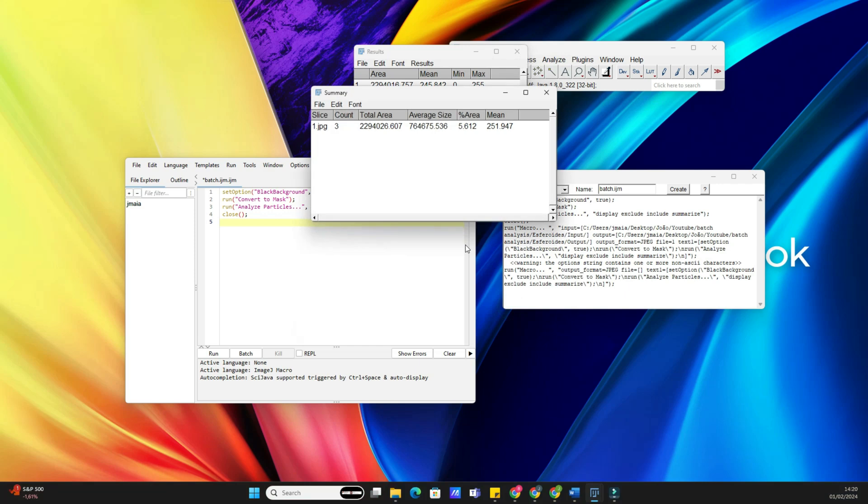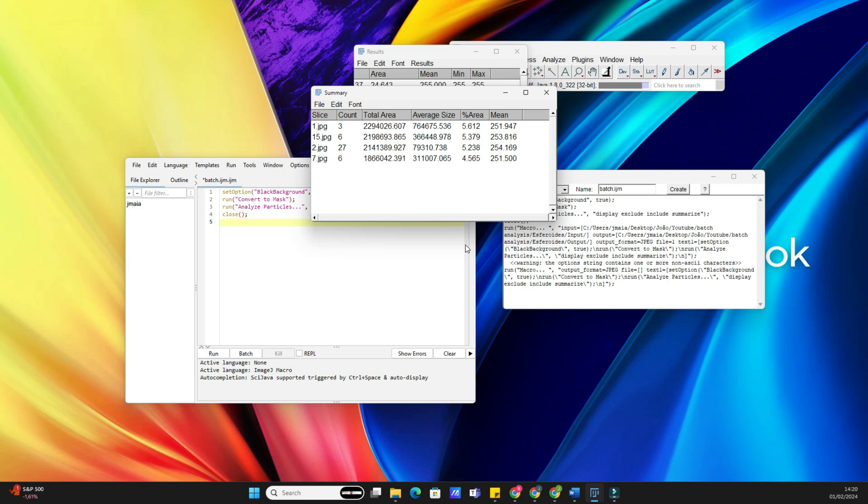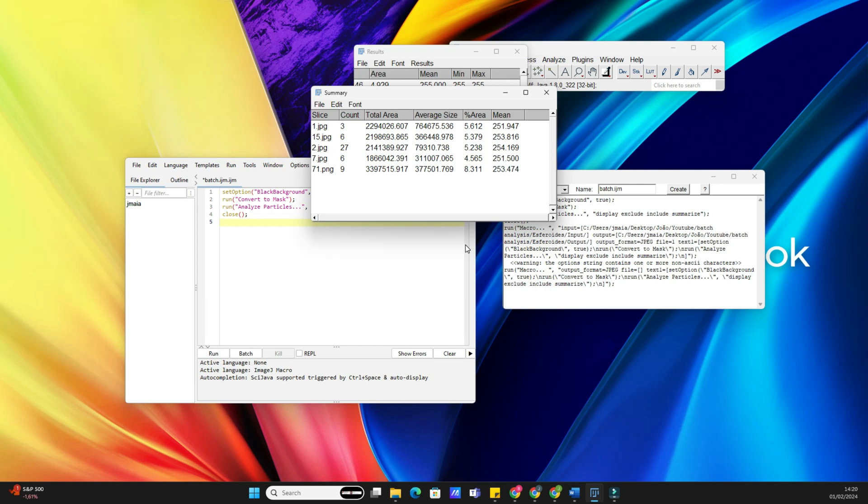If you encounter issues or want to refine your analysis, don't worry. ImageJ provides tools to troubleshoot and refine your process. Feel free to experiment and fine-tune your macro for optimal results.